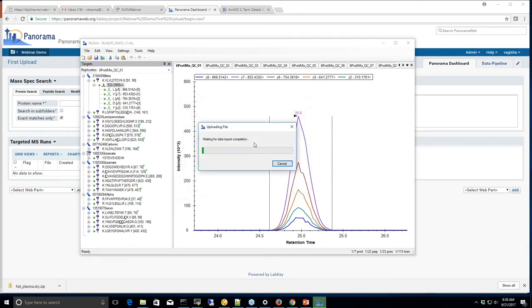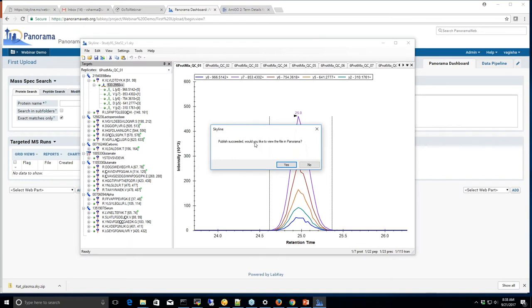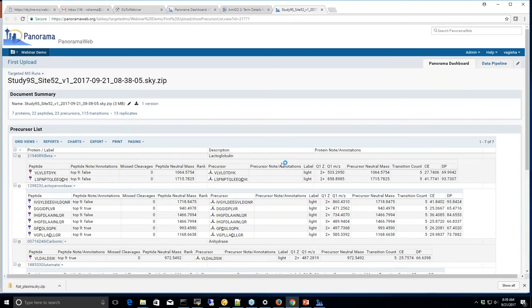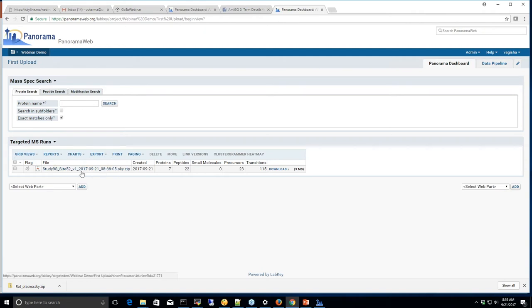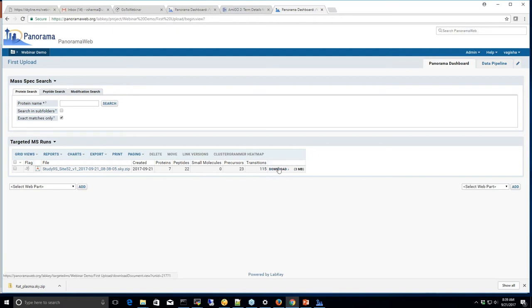You can only upload Skyline documents to a folder that has this flask icon — that is, a Panorama folder. I'm going to select that folder and click OK. Now Skyline is creating an archive of all the files required for this document and uploading them to Panorama. Once done, it asks 'Publish succeeded. Would you like to view the file in Panorama?' I'm going to click Yes. This takes me to the document details page, with the document summary box and the table with all the peptides and proteins. I'm going to go back to the home page of my folder — you can always do that by clicking on the name of the folder right under the navigation menus. Now on the home page, I see there is one file in my Targeted MS Runs box, with a download link as well.